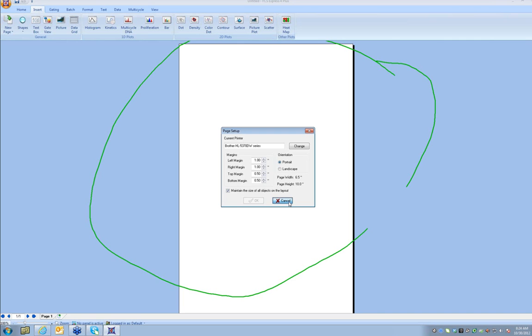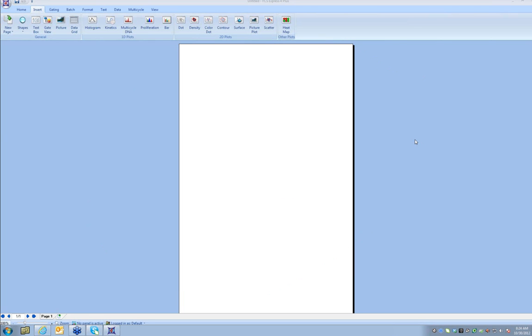And again, just to highlight that, if you want to do things in the software, try to do it in PowerPoint, then look in FCS Express in the same spot that you would look in PowerPoint, and odds are you'll find it. In PowerPoint, if you want to insert things on the page, you go to the Insert menu located here, and PowerPoint gives you the option of inserting shapes, pictures, and text boxes, and of course you can do all of that in FCS Express as well.